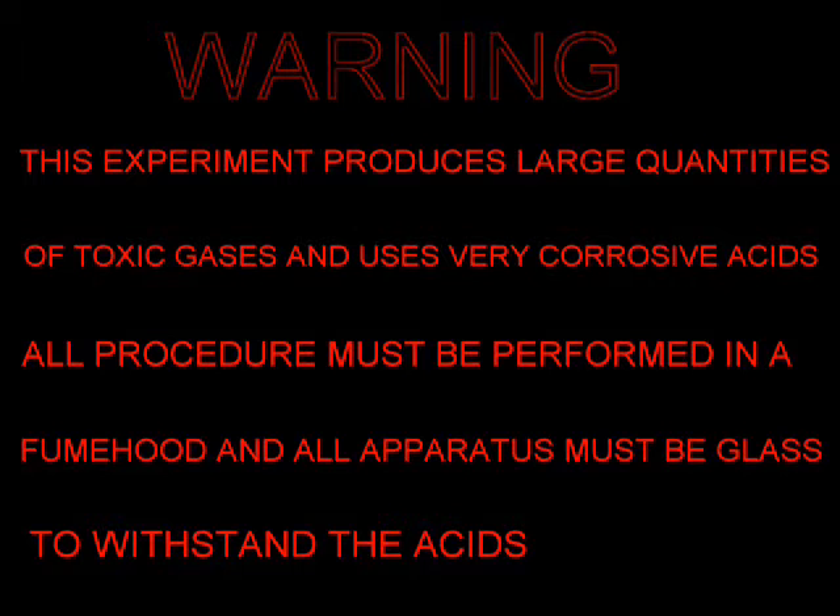As you all know, nitric acid is a very useful acid, able to dissolve copper, silver, and many other metals. In this video I will show you a simple way to make it.